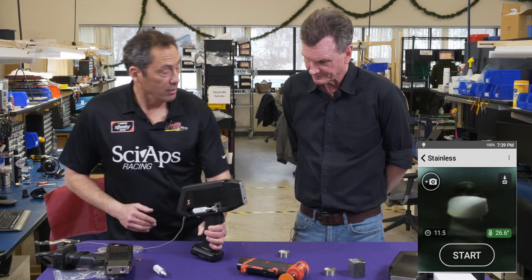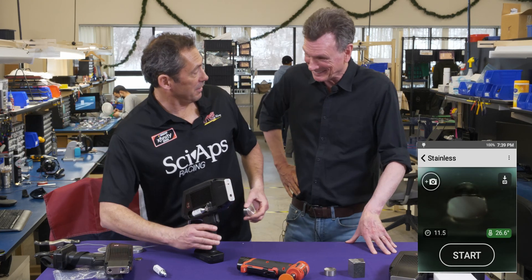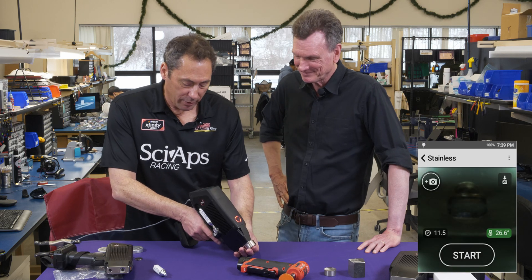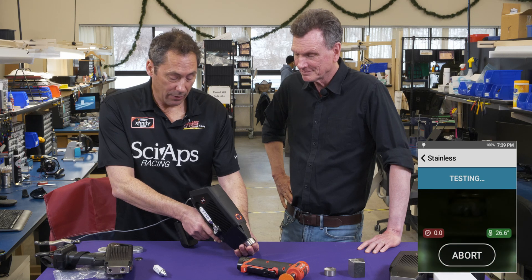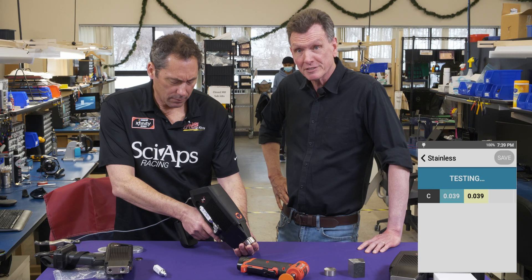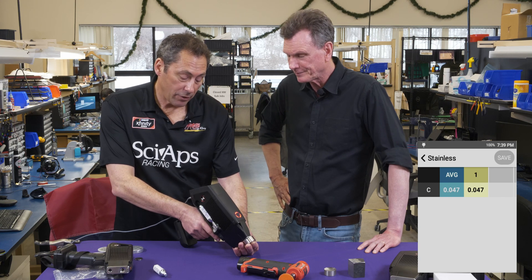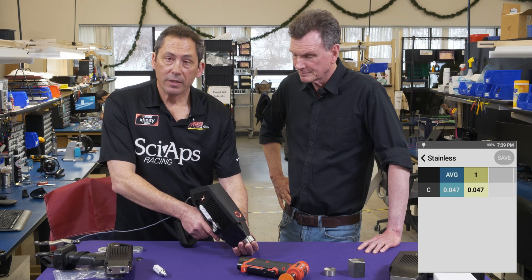We've already ground this sample so we're good to go. You pull the trigger and just like OES, it first does a pre-burn — and then it switches into actual carbon measurement. We're looking at several locations to get a better chemical average, because the LIBS beam is only about 100 microns.